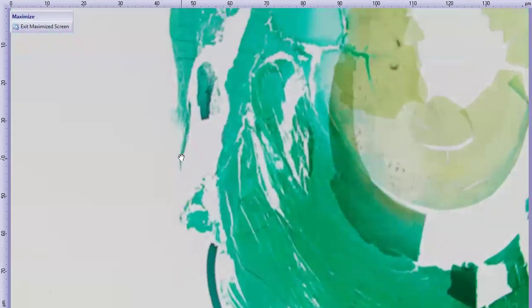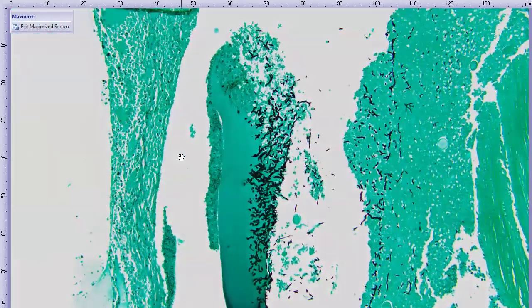kind of infection? They weren't very easy to see on the H&E in the vitreous, but I did a GMS just to look for them more. So if we head back up to the lens capsule, you can see that it highlights them even better.